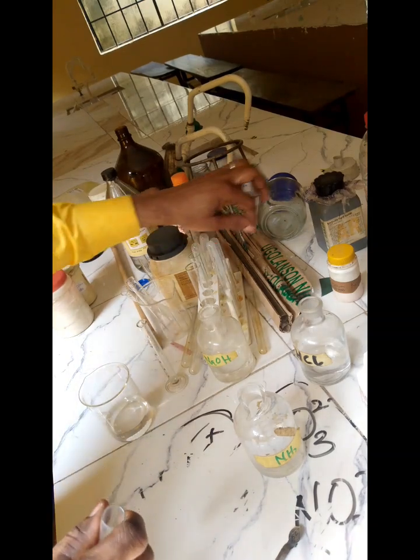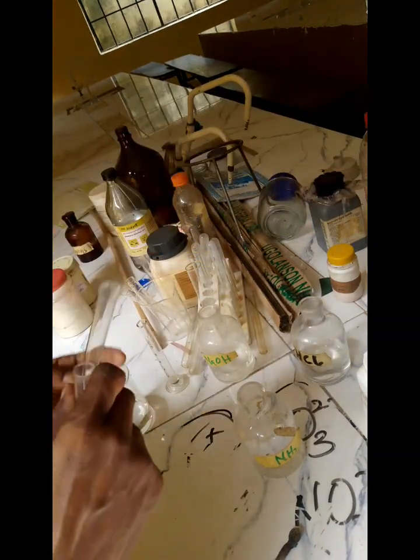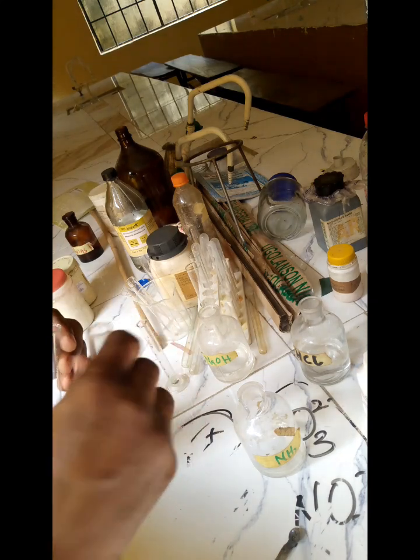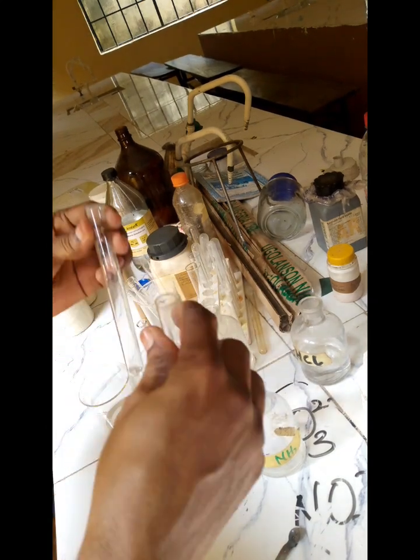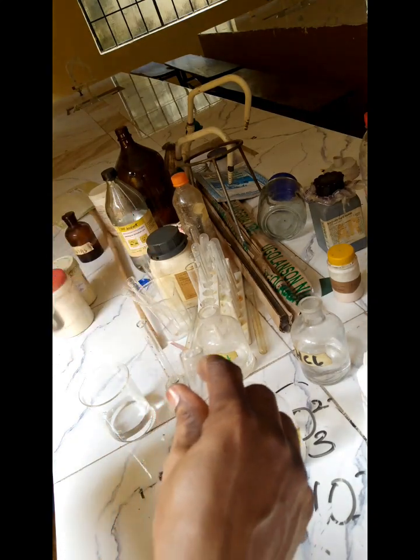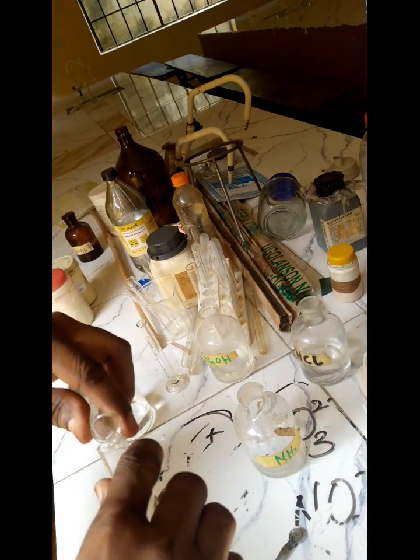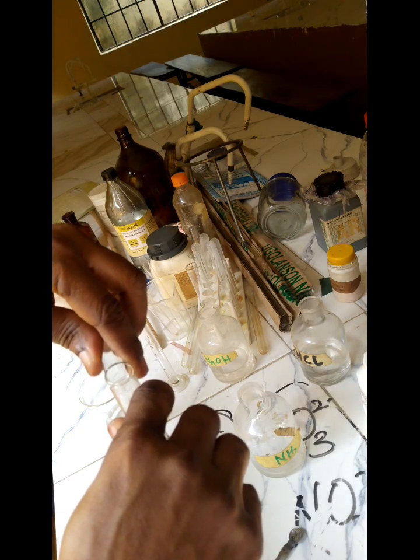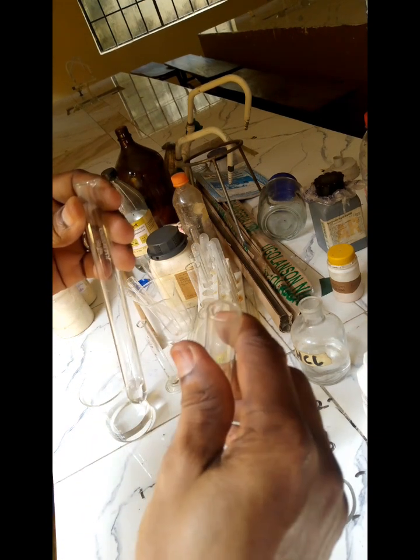So what we need to do is collect a small quantity of the salt into about 2 cm cube. All right, that's more than 2 cm cube, but anyway, let's work with it. I needed about 2 or 3 cm cube because I'll still be making use of it. Okay, so 2 cm cube of the salt.